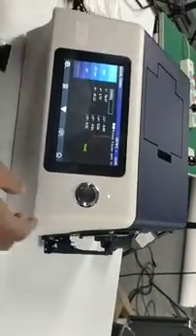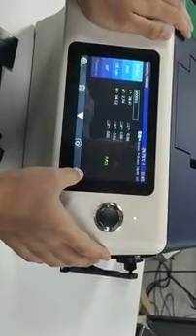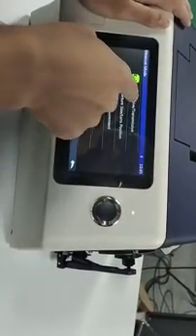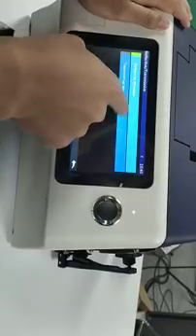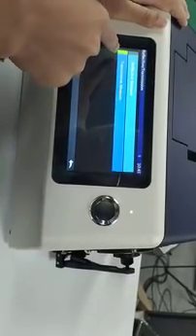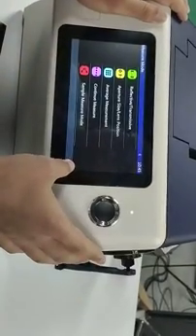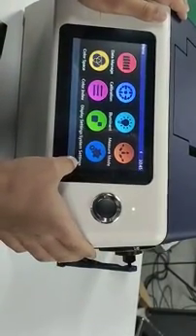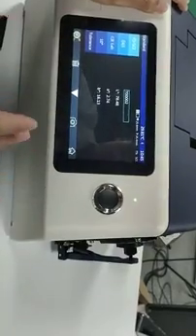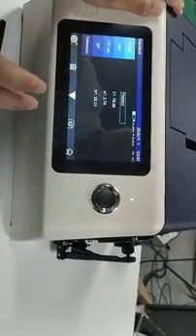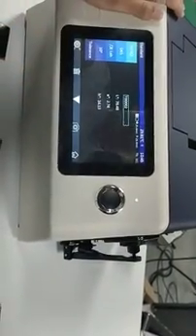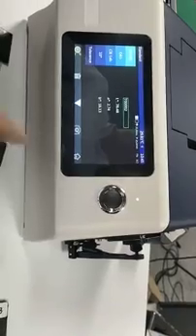Transmission measurement mode. Measurement mode. Here, reflective and transmissive. And we choose this transmissive measurement. Confirm. Here, every time you change the measurement mode, it needs you recalibrate. Ok.